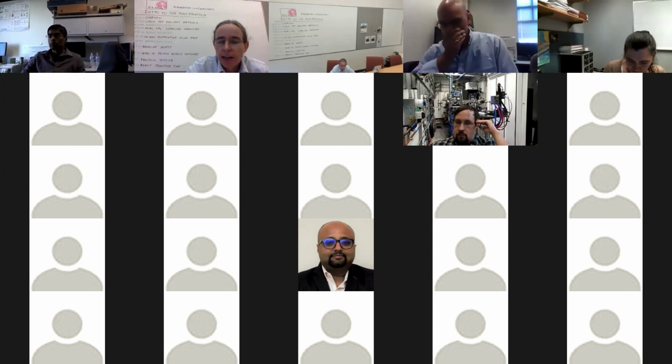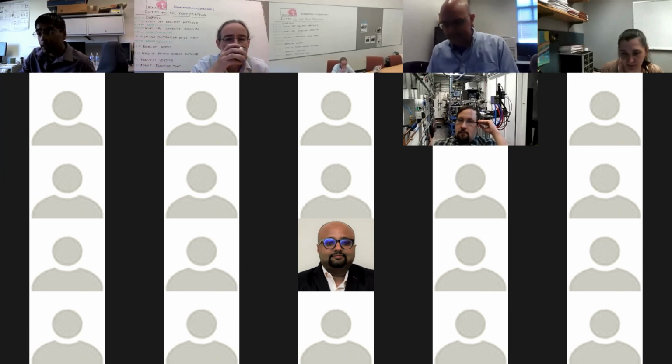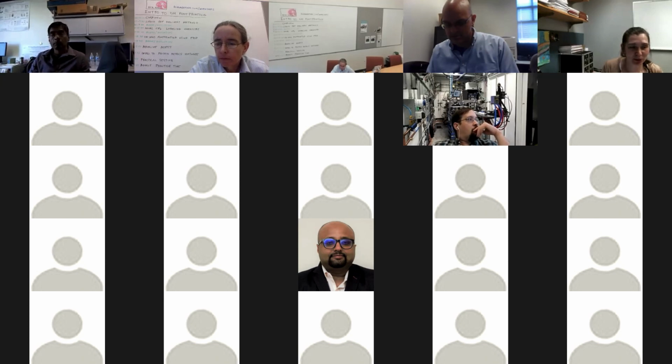Just looking back through the chat, it looks like Cyan had a question about the CF3 labeling as well. Cyan, do you want to ask your question? Yeah, so can they cancel each other, the OH labeling and CF3? That you have one site in one conformation, the OH is showing protection, on the other hand, CF3 is showing more reactivity? You mean going in different directions? Yeah. We haven't seen this, but again, we have a very small set of data to compare.